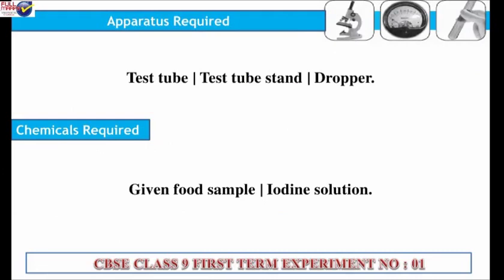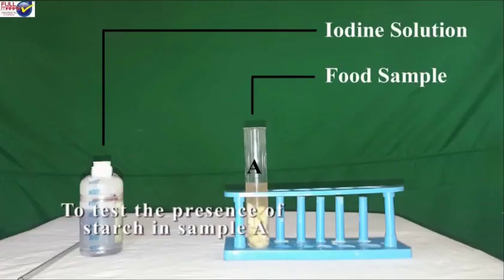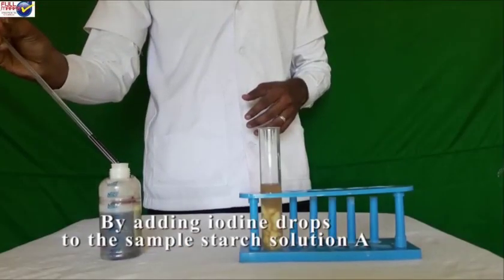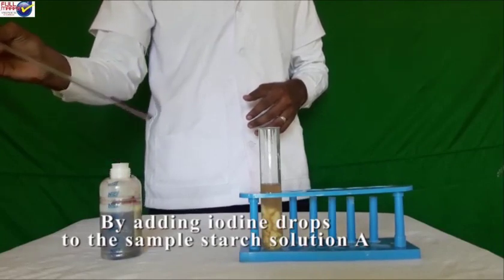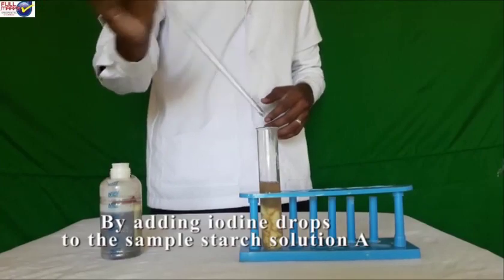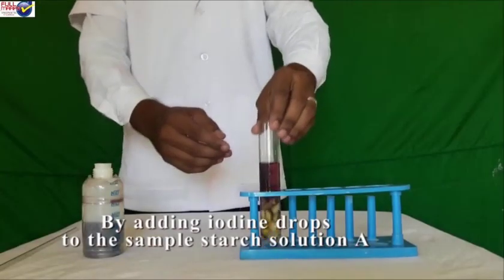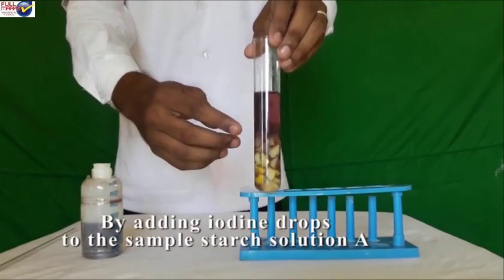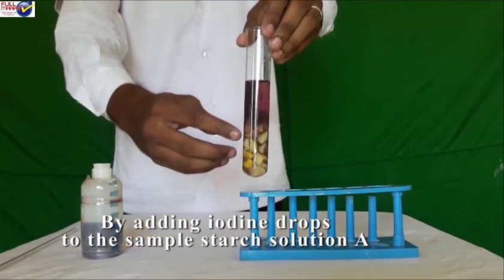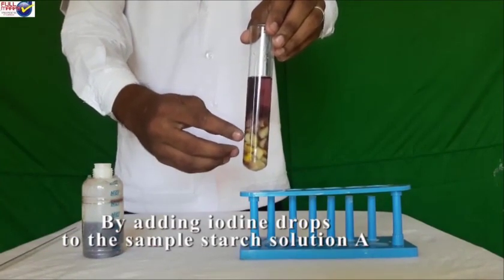Chemicals required: given food sample, iodine solution. Procedure: take a clean test tube and add a little given food sample and water in it. Add few drops of iodine solution in the starch solution. Shake the contents of the test tube. Observe the changes in color. Observation: the color of the given food sample changes to blue-black on adding iodine solution to it. Conclusion: the given sample of food contains starch.